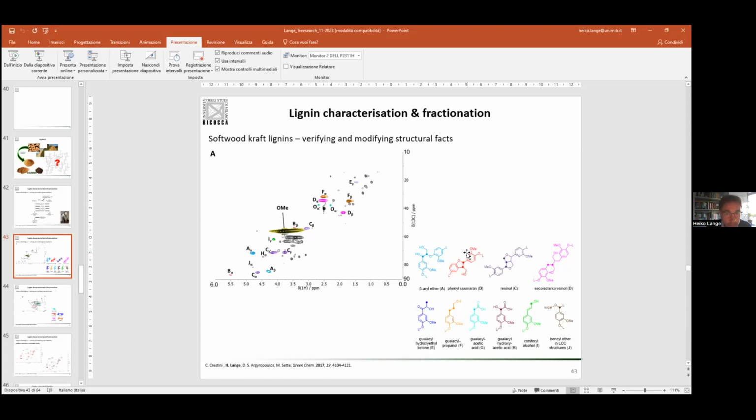Okay. So in that case, the only possibility is to run many more scans, right? So you have to eventually go, I do not know what NMR machine you have. It's a 400, 600. No, I have no idea, because I'm not the one actually doing the measurements. Okay, so you need to work on the signal to noise ratio in that case, and the only way to do that is to increase the number of scans. Okay, thanks. I mean, this is a tip I can suggest.